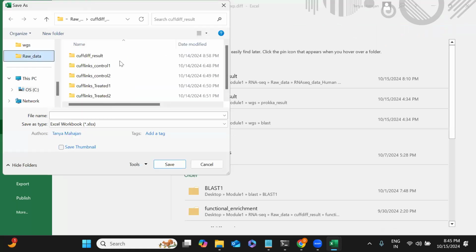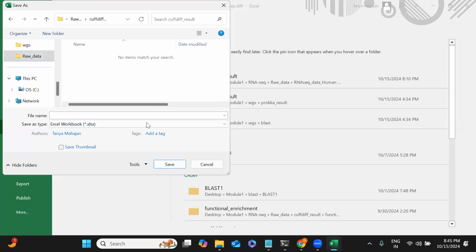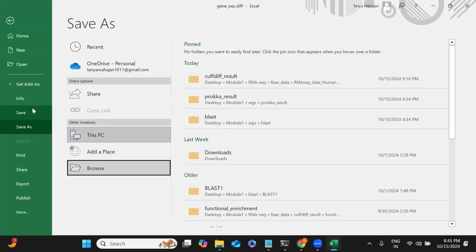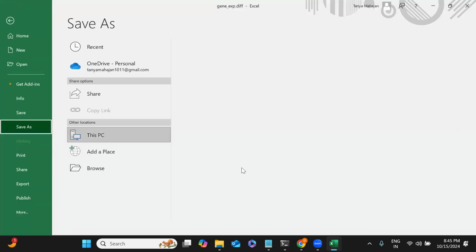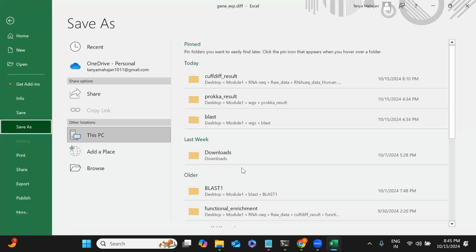Is it always easy to explain the result like you do here, or sometimes will it be difficult? No. The file which you are looking at right now in my system, the same file you will get for the other experiment also, sir.